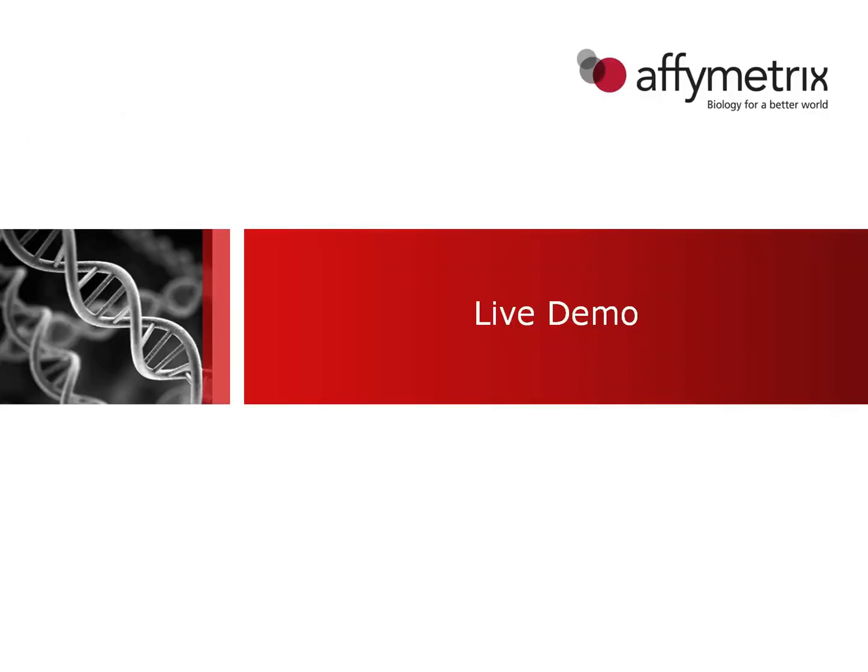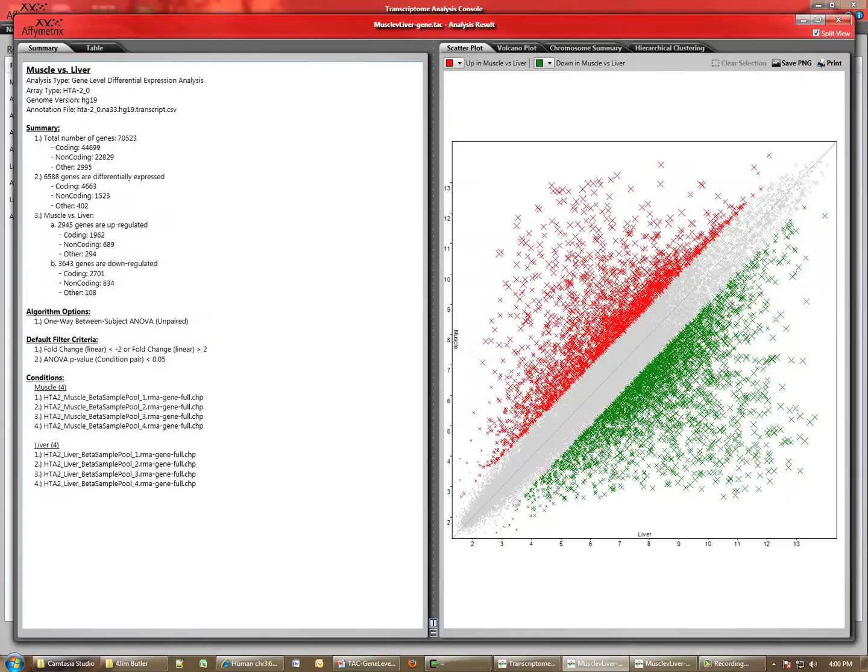Okay, so now we'll transition to a live demo of the TAC software. Here are the results after a standard analysis has been run for the gene level. On the left, we have the summary table, and on the right, we have the default view of the scatter plot.